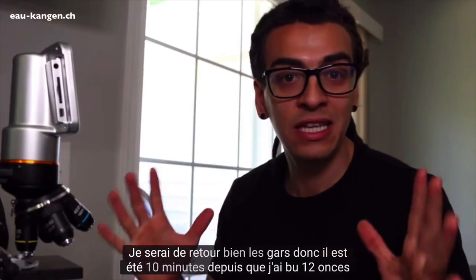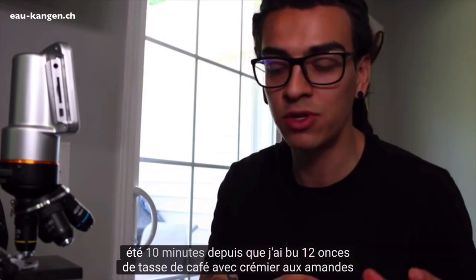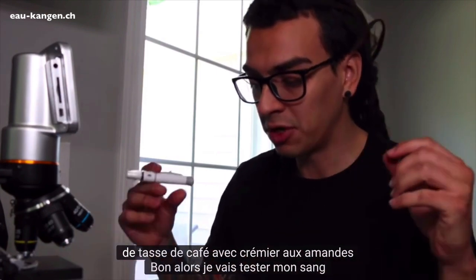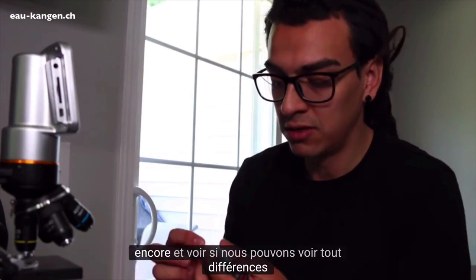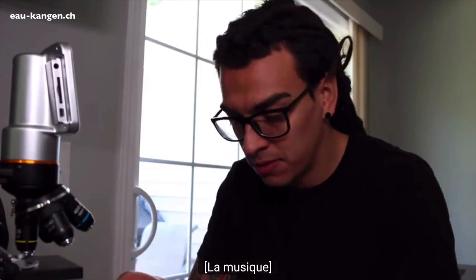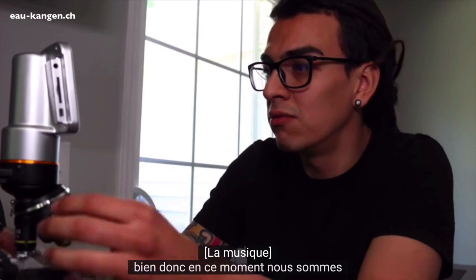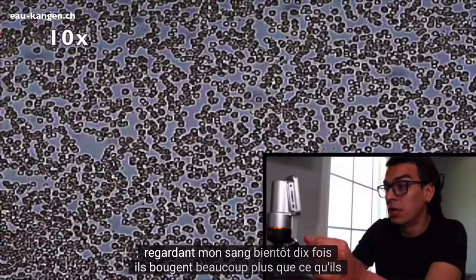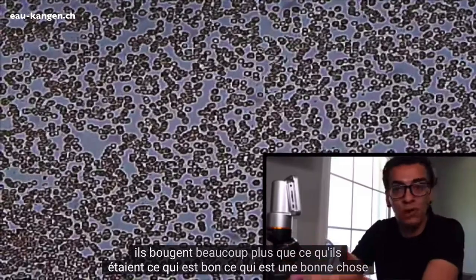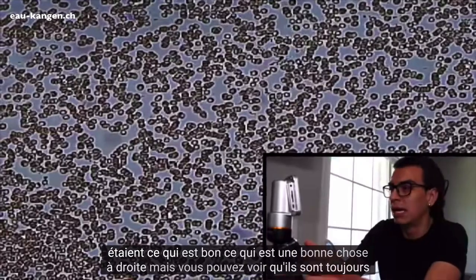All right, guys, so it's been 10 minutes since I drank 12 ounces of coffee with almond creamer. I'm gonna be testing my blood again and see if we can see any differences. So right now we are looking at my blood at 10 times zoom. They are moving a lot more than they were, which is a good thing, right?